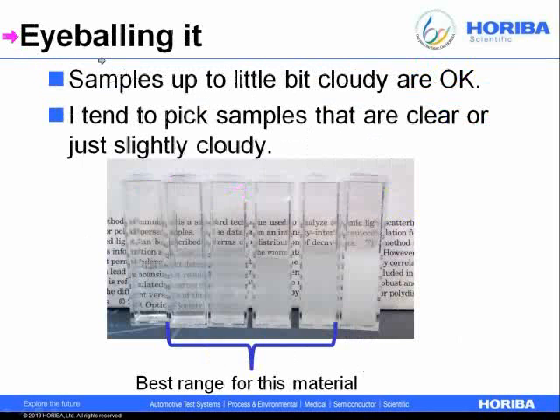So now, eyeballing it. You're in the lab, you need to make a measurement, you need somewhere to get started. And so I took some pictures of this sample. Now this material is about 1 micron. And I show these are the sample cuvettes. I put some paper behind it.